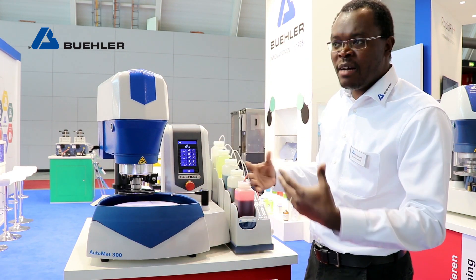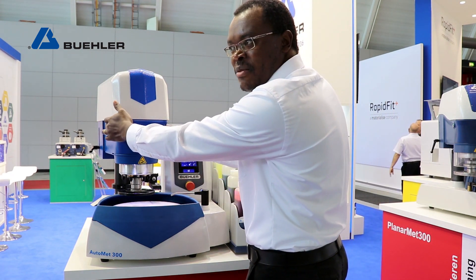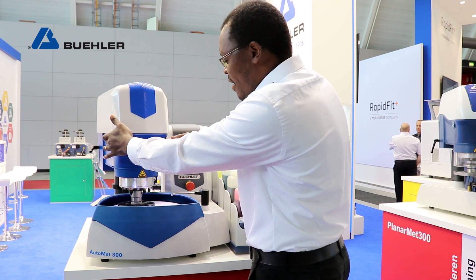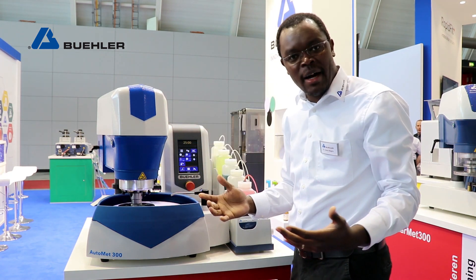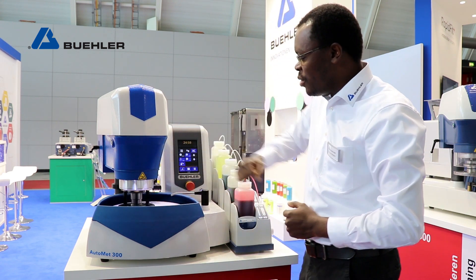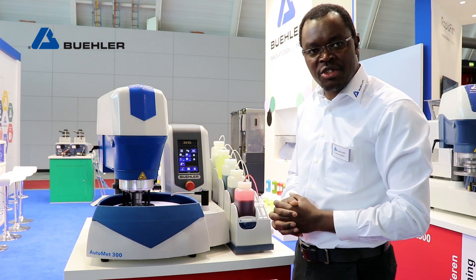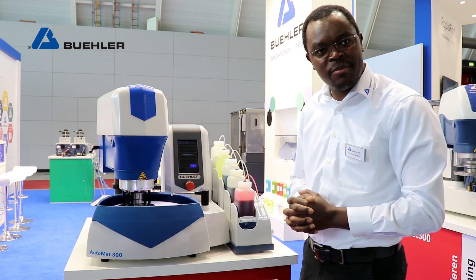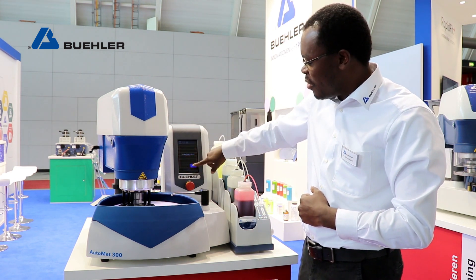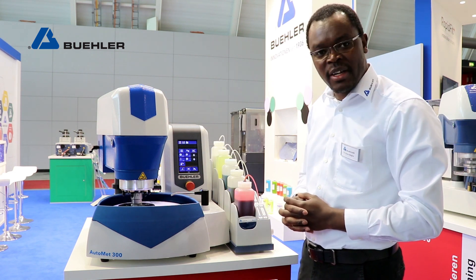Another feature in terms of safety during prep is two-handed starting of the machine, ensuring your hands are in a safe position before you're able to start the machine and any rotating or moveable parts begin. We also have an emergency e-stop button — if something ever goes wrong, you can quickly press that and automatically stop the machine. It intuitively shows you that you are in e-stop mode, and from there you can go back to the starting point.